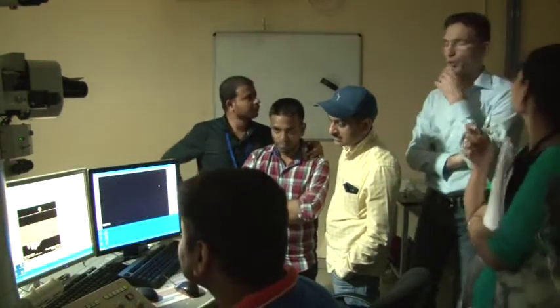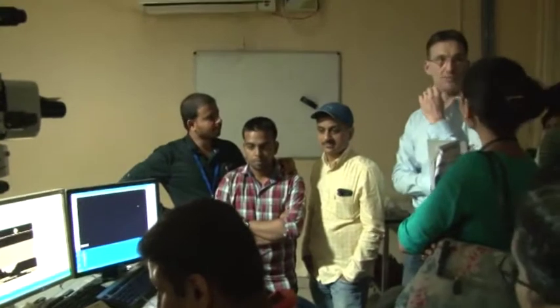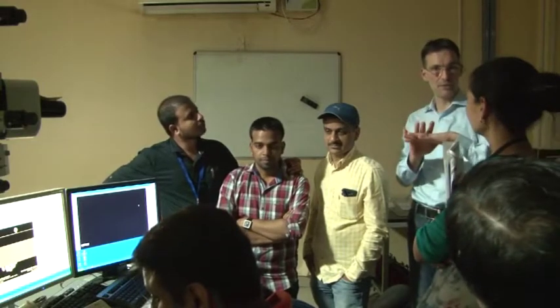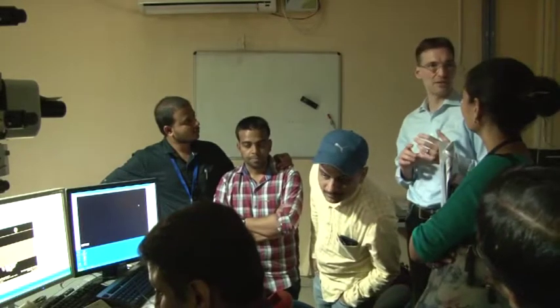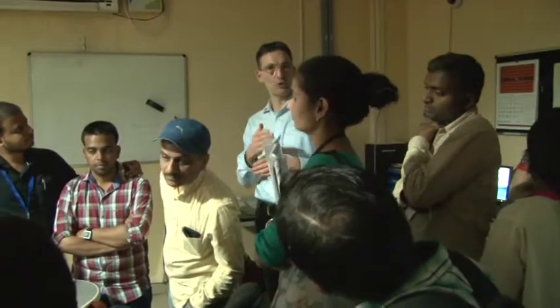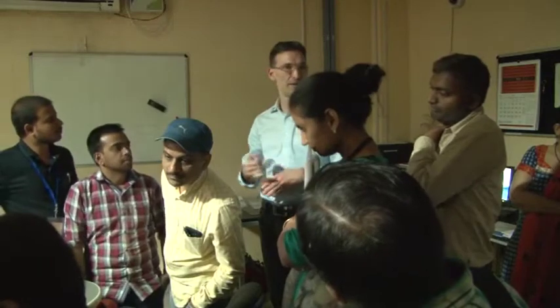So what I would like to show you tomorrow afternoon, we're going to have an exercise, and I would like to show you using some simulations, just in principle, how sensitive this contrast is on the local thickness of the sample, on the local tilt of the sample with respect to the electron beam. Just to demonstrate that in principle, without simulations you can hardly interpret such an image. It shows periodic contrast, but you never know without knowing the exact focus value where your atomic columns are. So this is what you cannot say just by intuitive interpretation of the image.